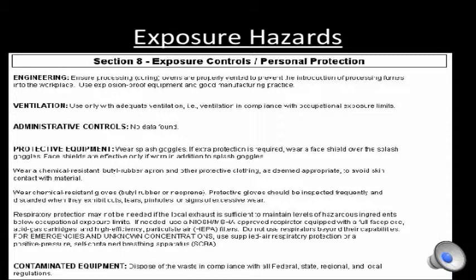Always read and be sure to understand the information on your materials safety data sheet before using the material. Make sure to thoroughly review the PPE Section 8 of the safety data sheet and comply with any PPE requirements. Additional PPE may be required. Do not rely purely on the manufacturer's recommendations. In this example, the chemical manufacturer recommends the use of splash goggles, possibly a face shield, butyl or neoprene gloves, and a butyl rubber apron.